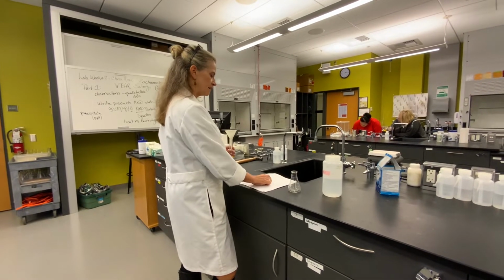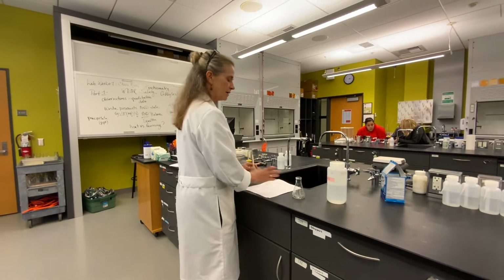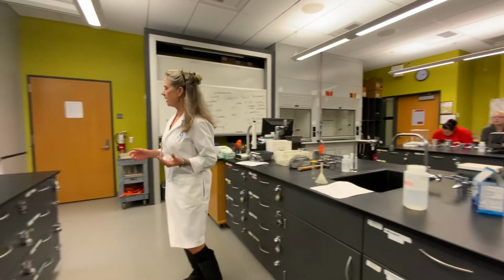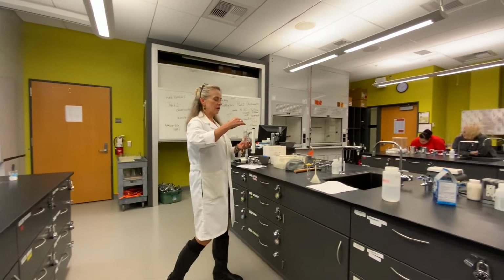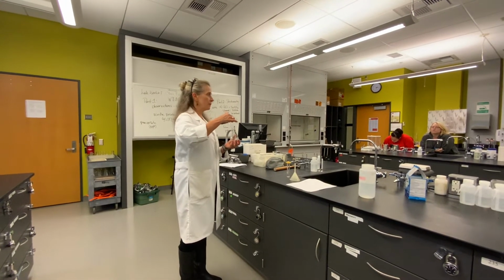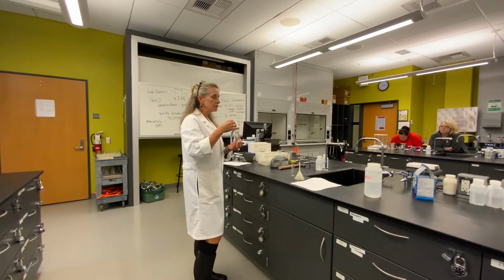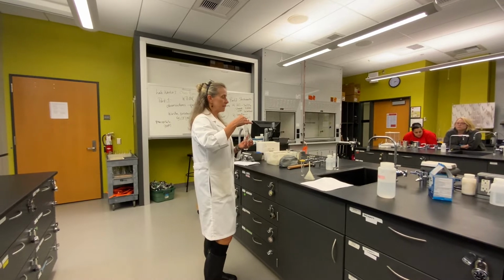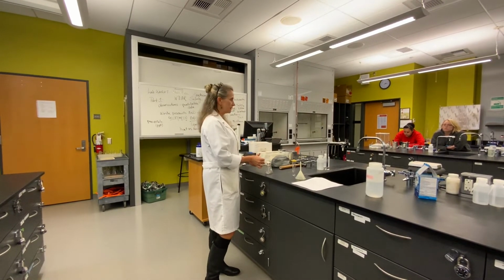And then basically what happens is, this is not going to stay upright. You're going to take your weighing paper that you weighed out your sodium bicarbonate on, and you're going to carefully get all of it in here. Remember how we talked about percent yield today, and we talked about actual yield? That's where the mistakes can happen. If you get any of this on the counter because it fell out, you're going to lose some of it. It's not going to be in there, right?